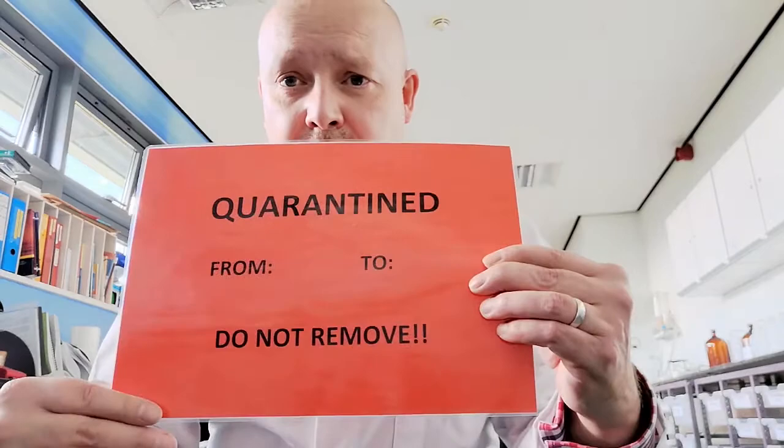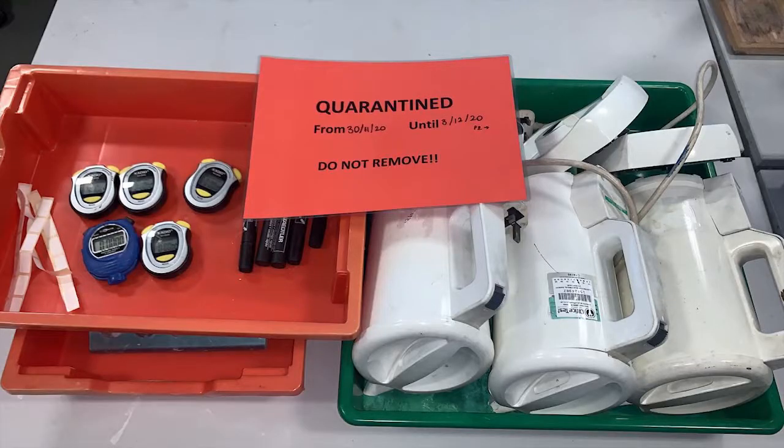Now thankfully CLEEPs have been really busy. They've been looking at all the DFE guidance and translating that into usable process. So if we do any practical work, we've either got to meticulously clean it, or we quarantine the equipment — and we have to quarantine it for 72 hours.